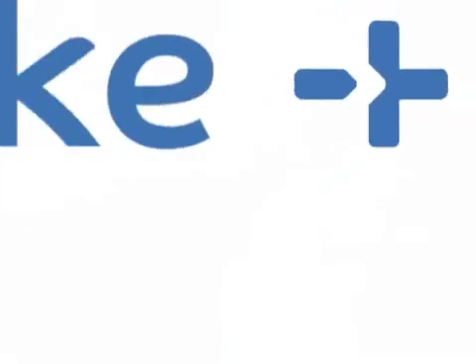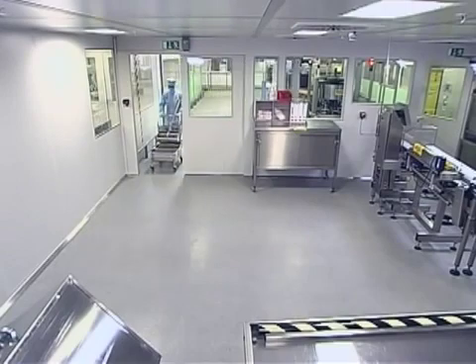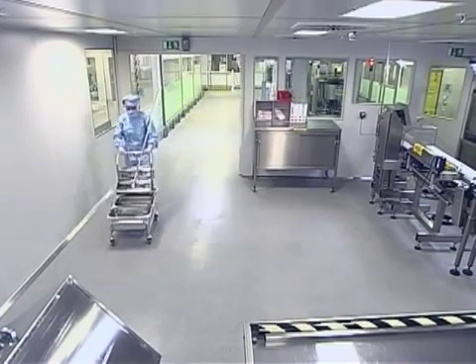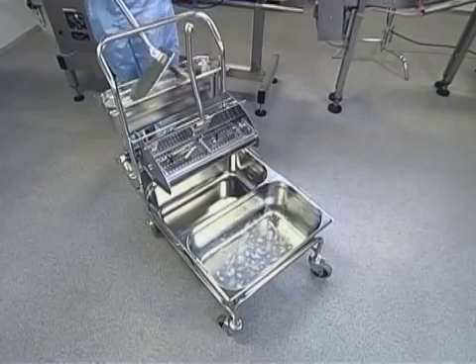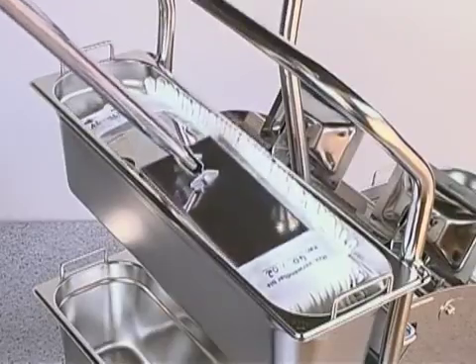Now one of the most important chapters: how to correctly wipe floors, ceilings and walls in a clean room. If you enter a clean room, you should position the cleaning system trolley so that you need to move it as little as possible. Now use the mop holder to take one of the mop heads out of the upper bucket of the trolley, if possible without touching the mop head with the fingers.